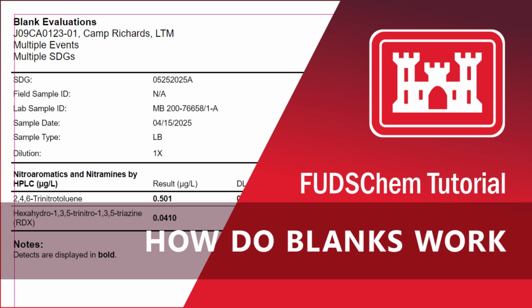This video will go over the basics of blanks in FUDSChem. We will discuss how to set up the rules that govern the ADR's behavior towards blanks and how to add blanks for field data.